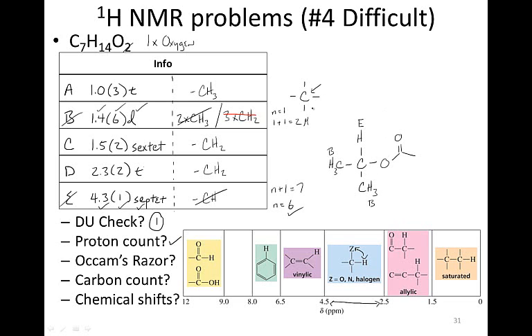So at this point, this carbon is now this carbon, so we've used that guy up. It's no longer a puzzle piece. We've also used up an oxygen, so we've used that oxygen up. It's no longer a puzzle piece. And we've also explained away the singular degree of unsaturation that we have in the molecule. Okay, so now we've taken care of 3 pieces of data almost simultaneously. So now all we have to do is really explain a CH2, a CH2, and a CH3. So since we've started to introduce this carbonyl group, this is an ester group, we might as well go ahead and start adding carbons to that.